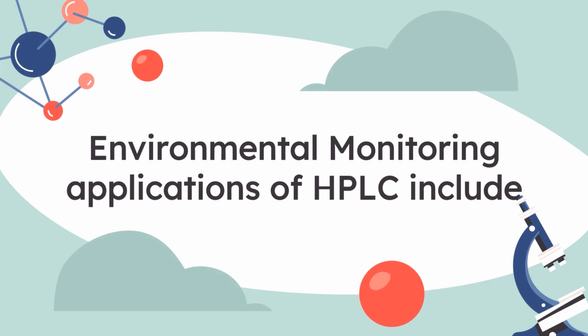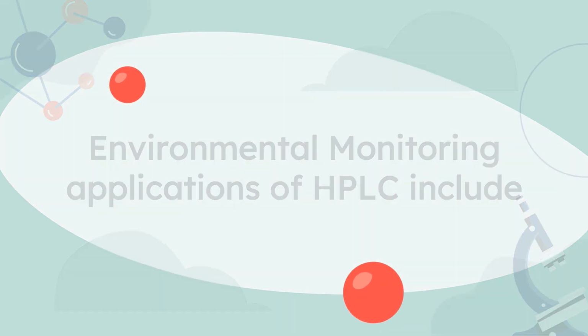Coming to the next application of HPLC, that is environmental monitoring. It includes the analysis of water quality, air quality monitoring, soil analysis, and food and beverage analysis.